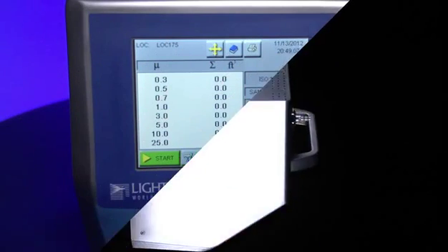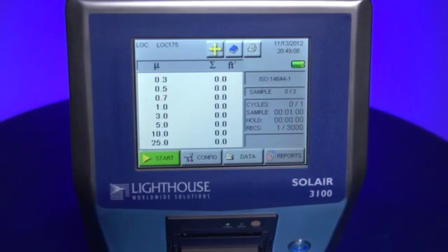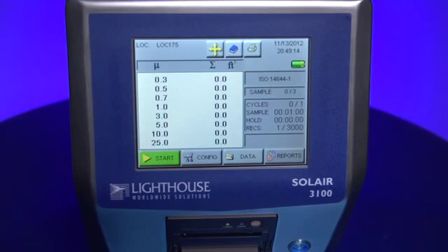This tutorial will cover the Locations function in the Solair line of particle counters from Lighthouse Worldwide Solutions. The Solair has the ability to record location information along with your particle counts. This is a great tool for building reports and presentations for your own analysis or for your customers.